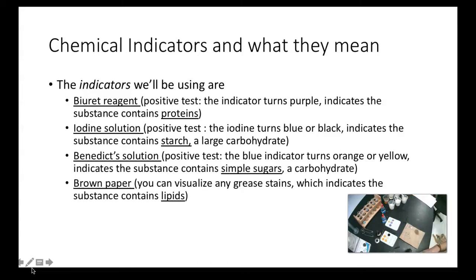simple sugars. Okay, and then a very, very complicated, very technical test that we do to test if a substance has lipids in it is a brown paper test. Okay, I'm going to go through these results that you're seeing in just a minute.